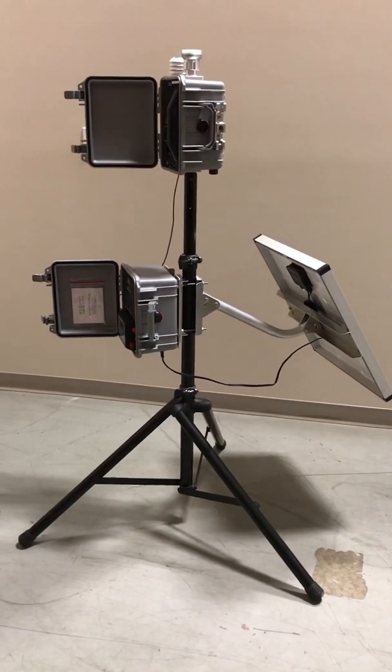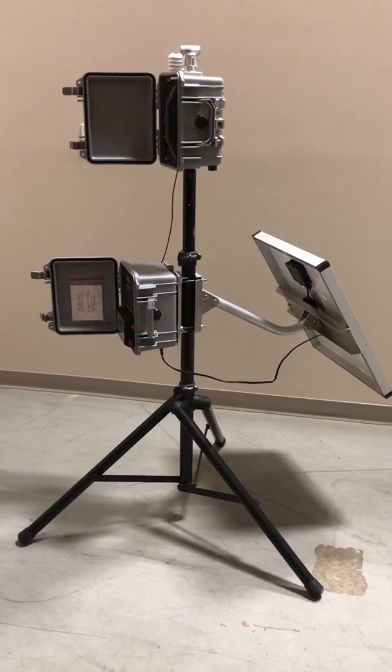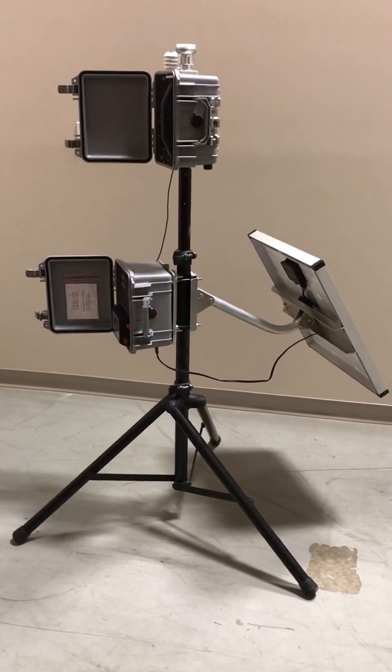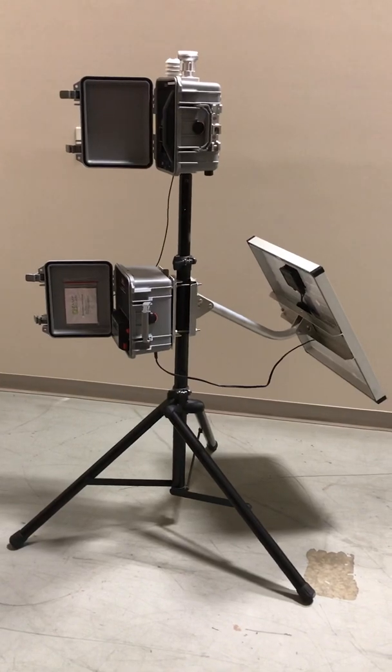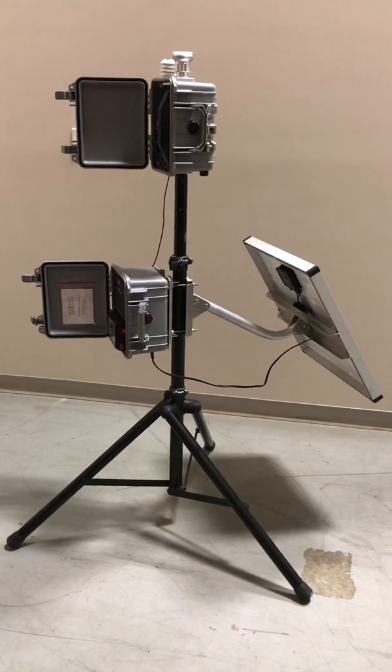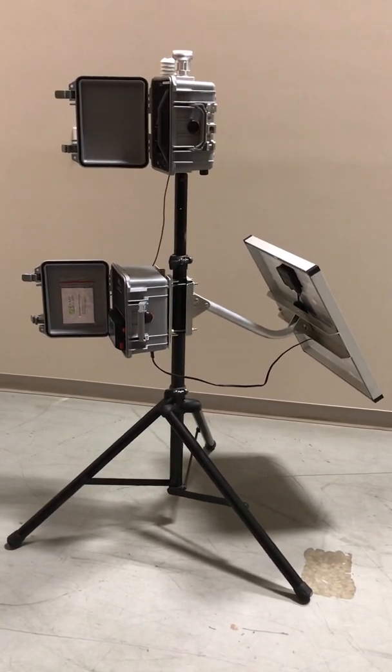So this is a portable field unit and it does not require AC power.